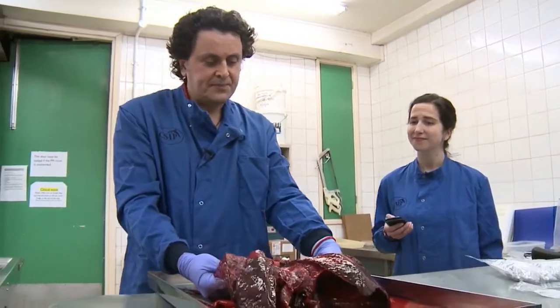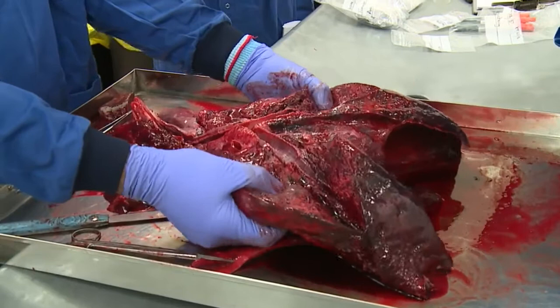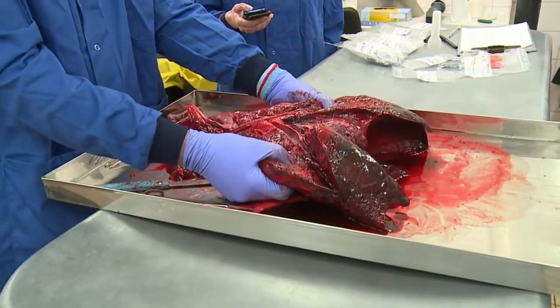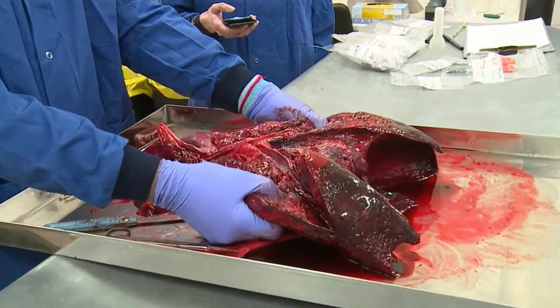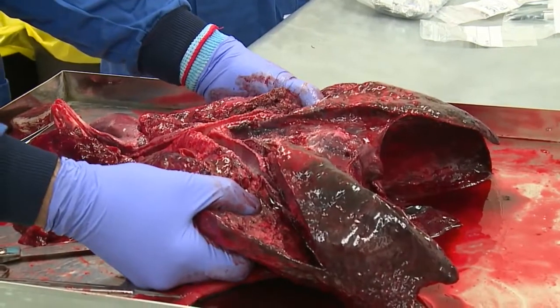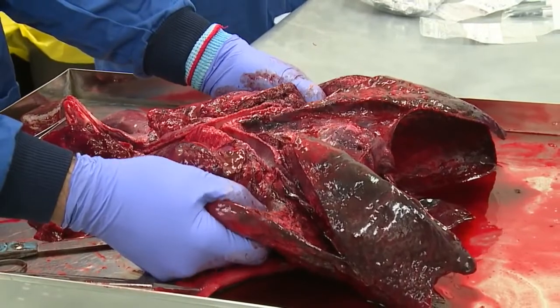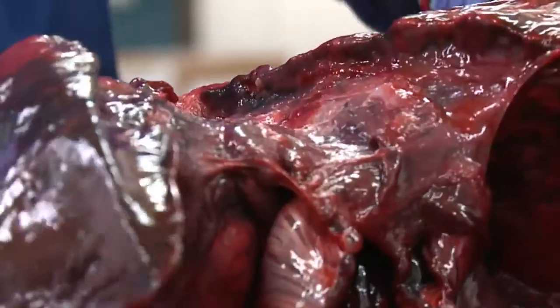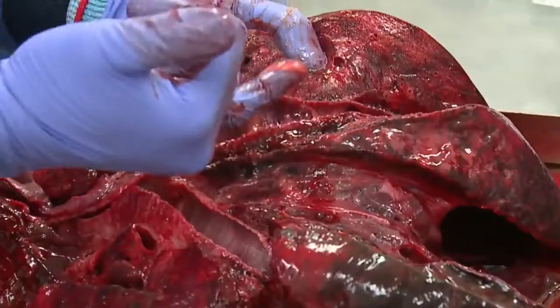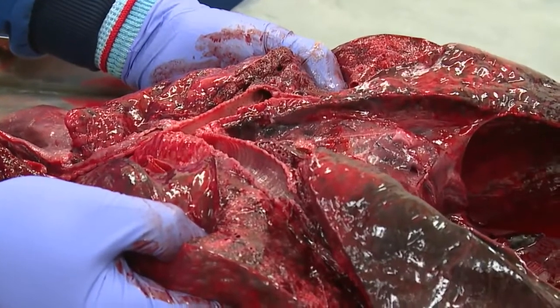Okay, so while I was nattering, I've opened up the airways, and it doesn't really come over on the camera, but I can feel that the lung tissue is really rubbery. There's some crackling. That crackling is emphysema. We've got little ruptures in the alveoli in the lungs with some bleeding out of some of the air, and that's causing this crackling. And then we've got this persistent froth in the airways. No seawater, which people are often surprised at.